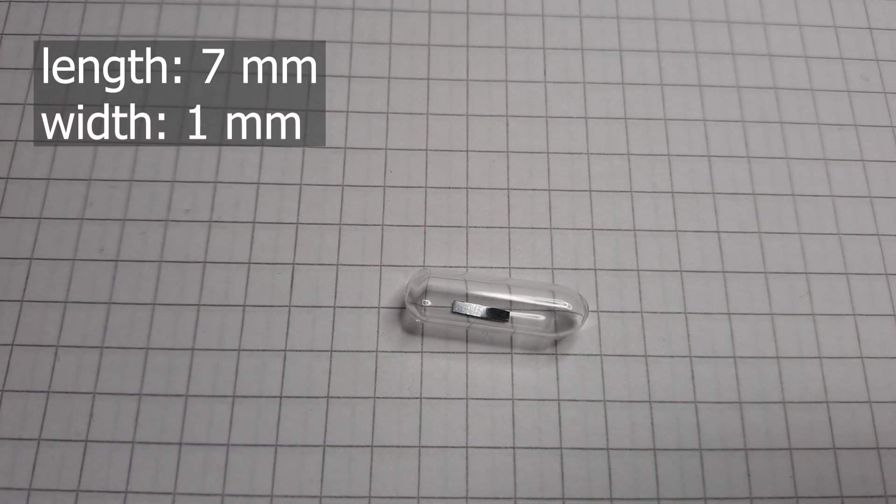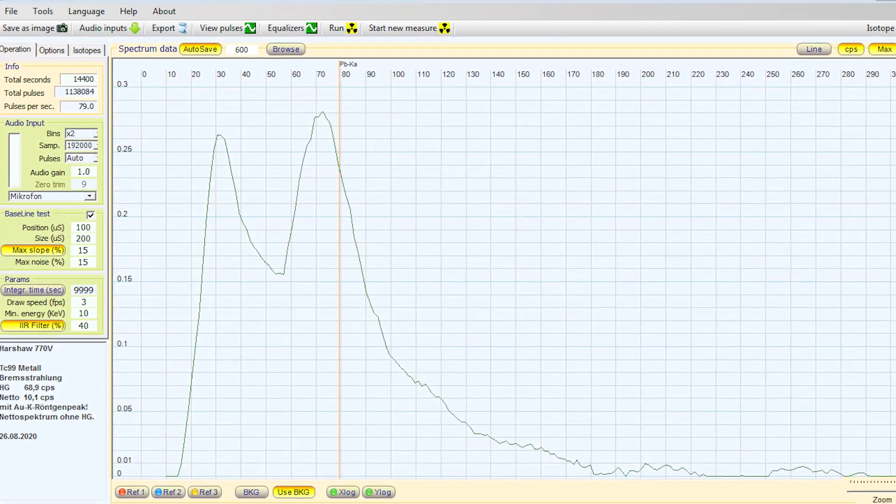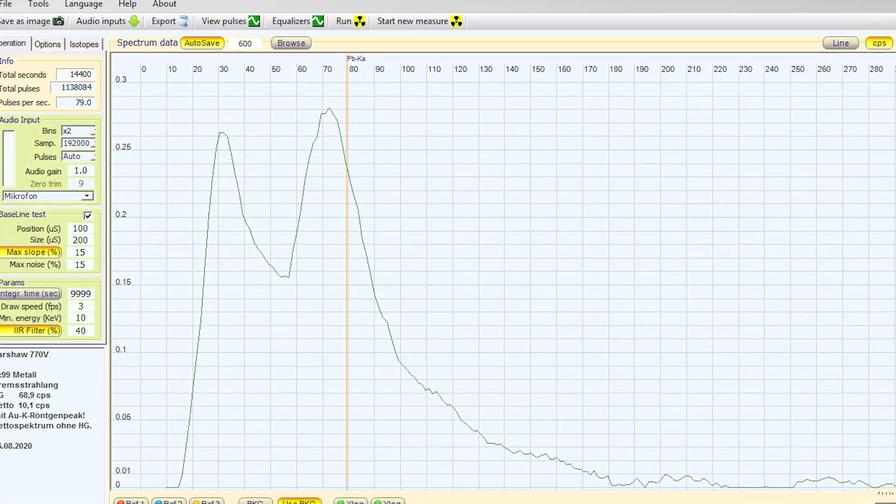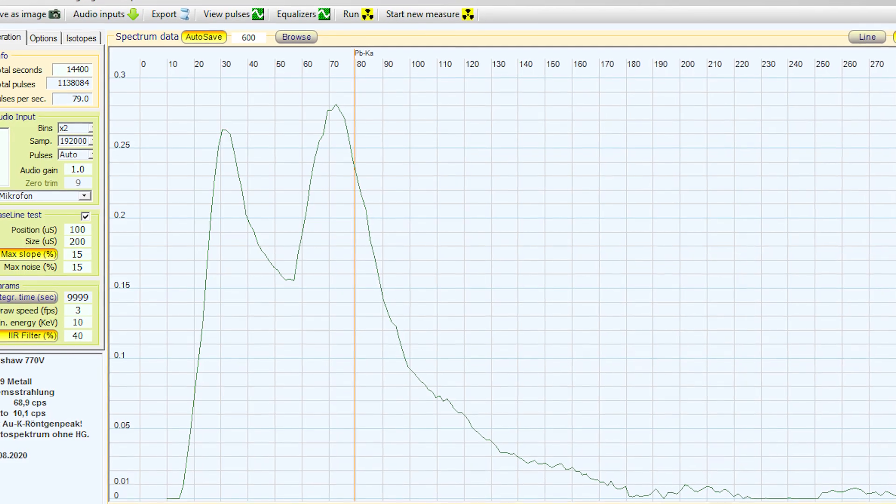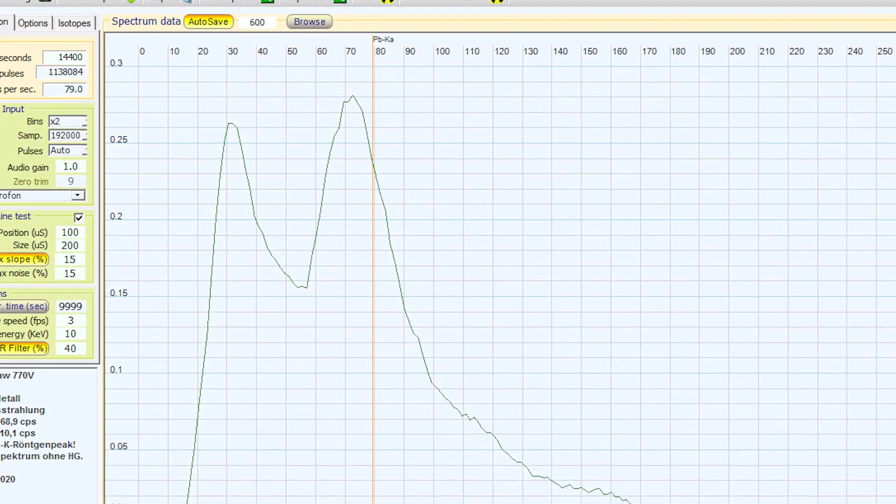Beforehand, only one thing could be analytically confirmed before purchase. It was deposited on gold. As proof, I was shown a spectrum from Theromino on which the gold X-ray lines were visible. So far so good, this can even be visually verified.